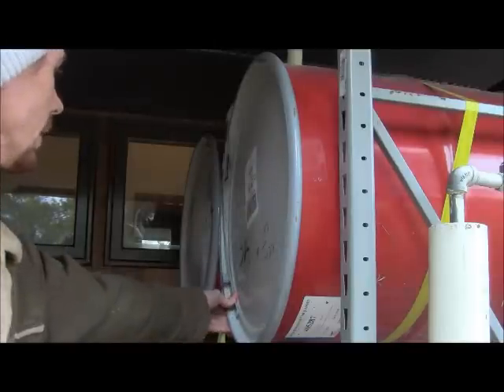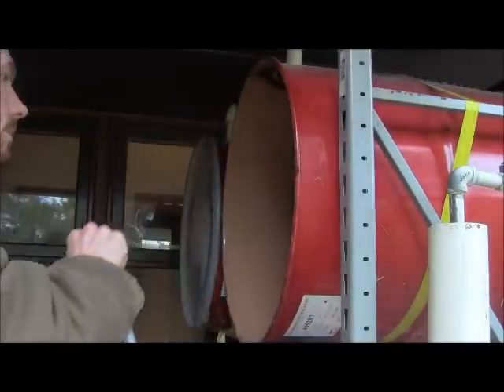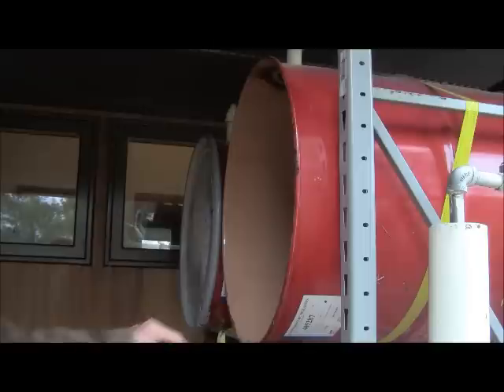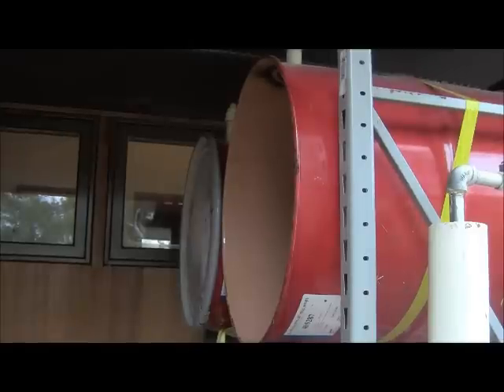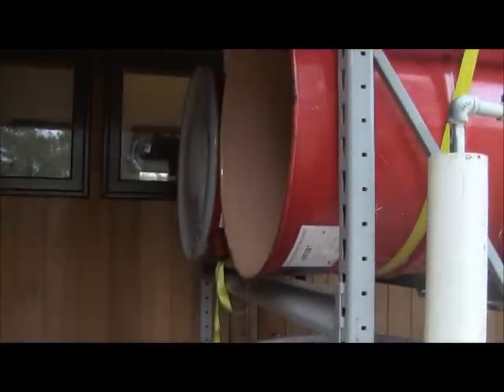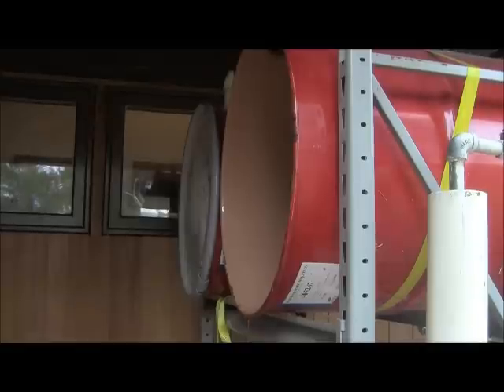The front of the barrels is where you load — just pop off a swing clamp and pull the front off. Mine isn't quite level yet since I just finished building this and have been testing. There's still a little work to do getting some shelving inside so I can load efficiently and maximize the space without stacking things on top of one another. Overall the goal is simple: boil steam from the bottom, have it go up and get trapped in the chambers, keep the substrate hot, sterilize it, and then inoculate when ready.